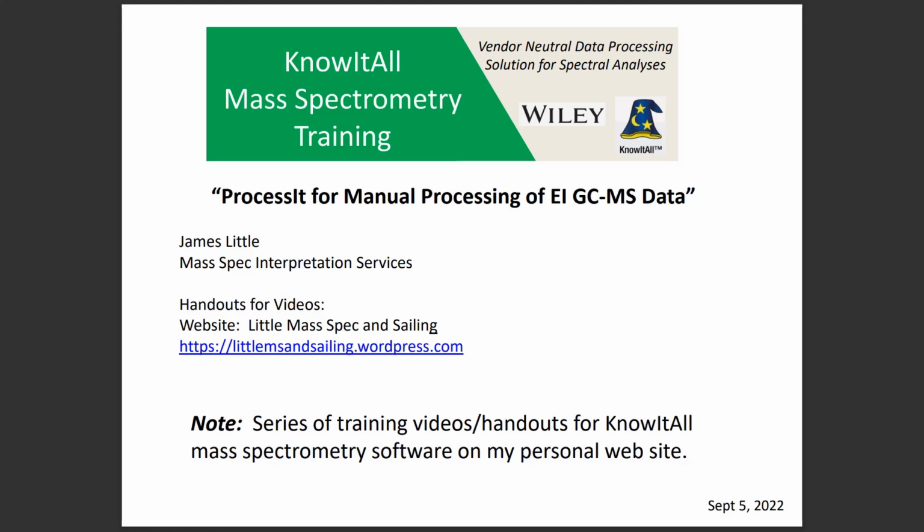Today I will be discussing Wiley's newly released software for processing mass spec data. It is part of their vendor-neutral data processing solution, KnowItAll, which is utilized with a variety of spectral techniques including mass spec, NMR, infrared, and others. Today's presentation is entitled Process It for Manual Processing of EI/GC Mass Spec Data.